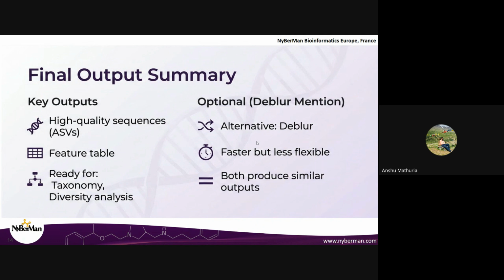You can use Deblur as well instead of DADA2, and that is your homework for the day. In the next session you should show me the files you generated using Deblur, and you need to run the commands similarly to the way we ran them for DADA2. It will be just the Deblur plugin instead of DADA2, and it was present in that Moving Pictures tutorial. Just go through it once and understand what Deblur is.